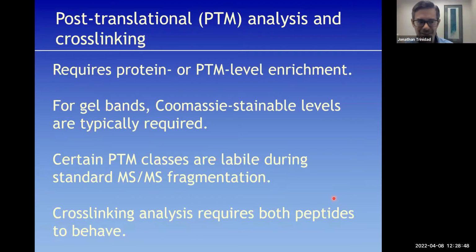When the person is a biochemist, when they're recombinantly expressing it in some heterologous expression system that's really been designed to give you lots of protein, then they can give us lots of protein, and people tend to be happier. We can find more things the more sample you give us, right? But of course, in the real world, or in parts of the real world, somebody might want to immunoprecipitate endogenous levels of their protein of interest. And then this presents, of course, much more of a challenge at our end. Not that we're doing anything particularly differently, but we just don't have that much material to work with.